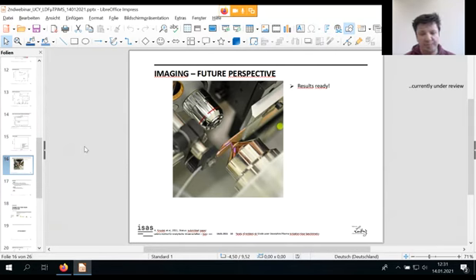A topic I've now been working on is imaging. I used liver tissue from mice and shot the laser on the tissue directly. We had a slightly different substrate design to get this working. As this presentation is recorded, I'm not really allowed to dive deep into that because it's a paper in submission, but that would be another application and perspective.